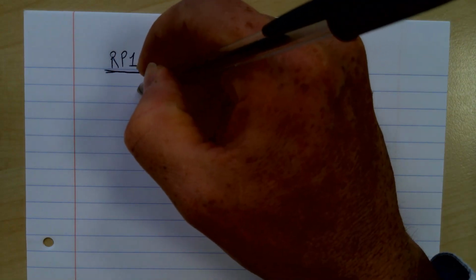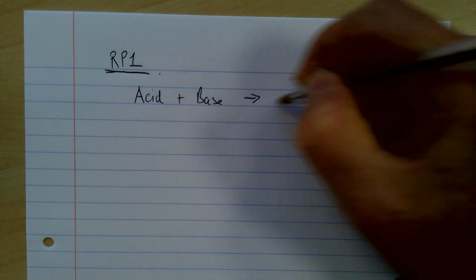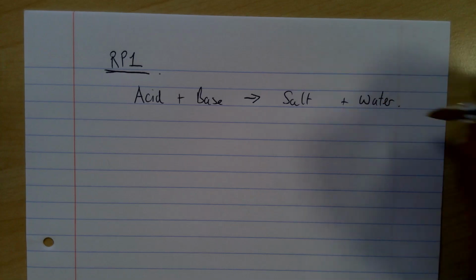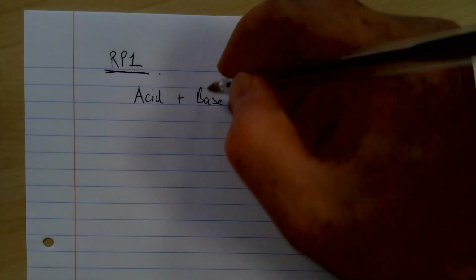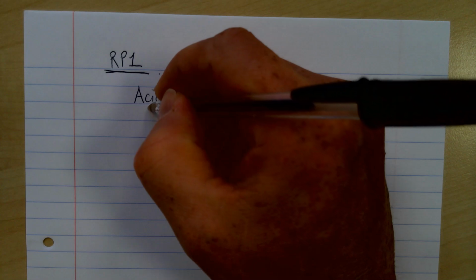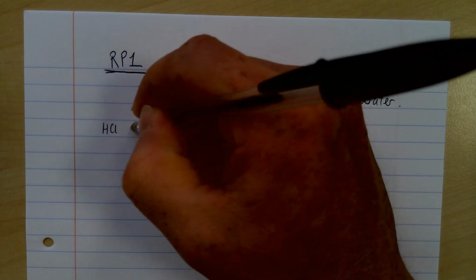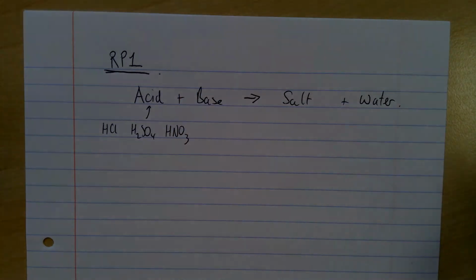So the idea of required practical 1 is it's a neutralization reaction of an acid plus a base to give us salt and water. That's one of those general reactions of neutralization that you would know. But there are some details here. The acid is always going to be one of the strong acids, probably hydrochloric acid or sulfuric acid, but it could be nitric acid. If you don't know the formula of those acids, this is my reminder that you should know them.